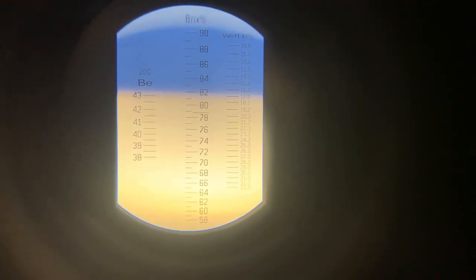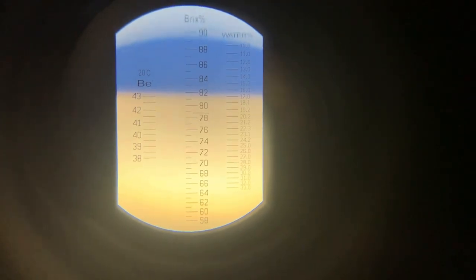This is what it would look like now. You see the blue line is below the 17% moisture content. Ideally I'd like to see a little bit less than that, but it's kind of hard in the eastern shore of Maryland here to get moisture levels down below 16, 15, 14%.